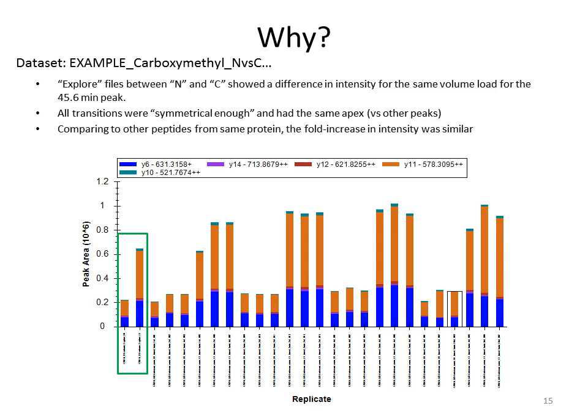And so in all of these cases, these are the normal, those are the cancer, those are the normal, those are the cancer. And that confidence led us to believe that that was probably the right peptide. Then we looked at other peptides from the same protein, and they had a very similar fold change between the two samples. So that gave us even more confidence. Is it the right peptide? I honestly have no idea, because we don't have standards to verify that. But as a starting point, this is, again, just giving more confidence to our data.